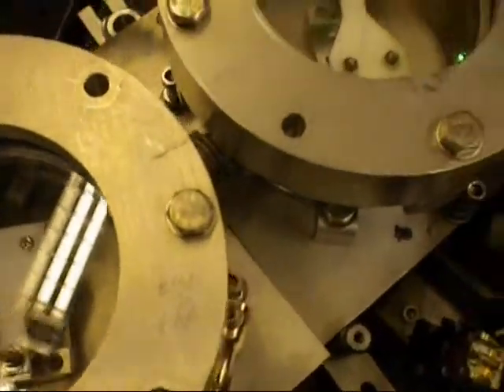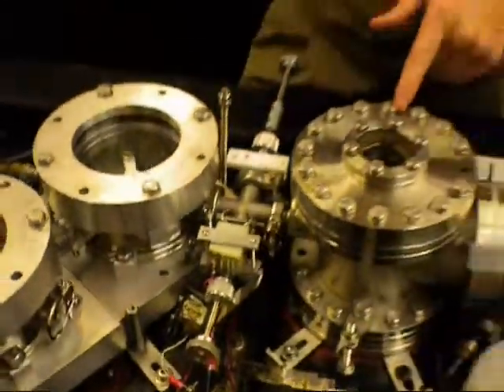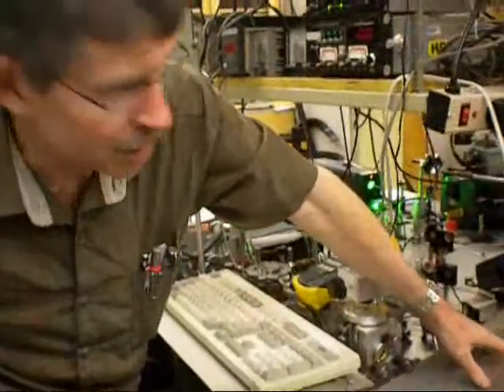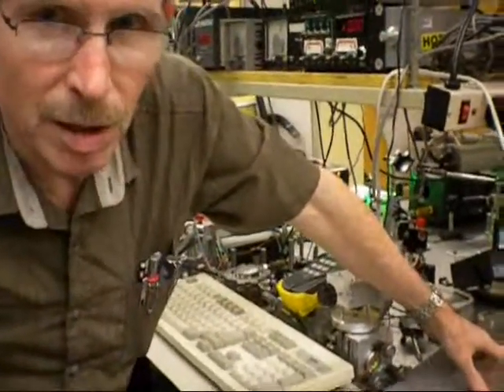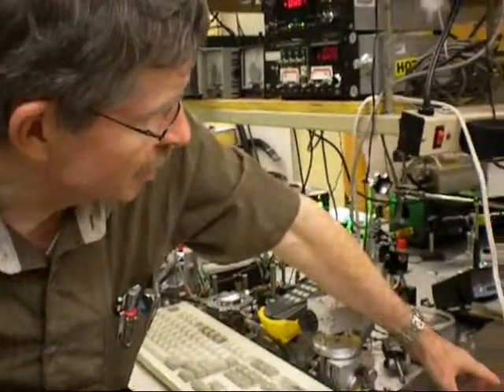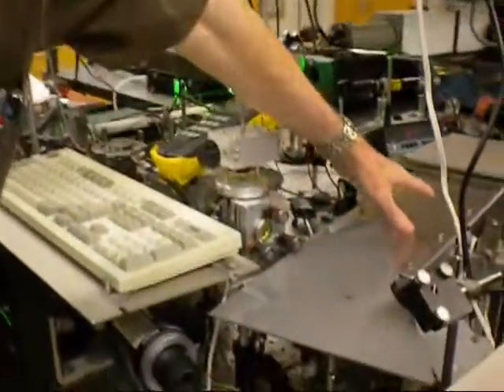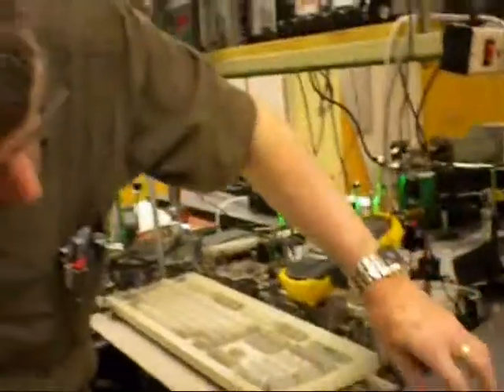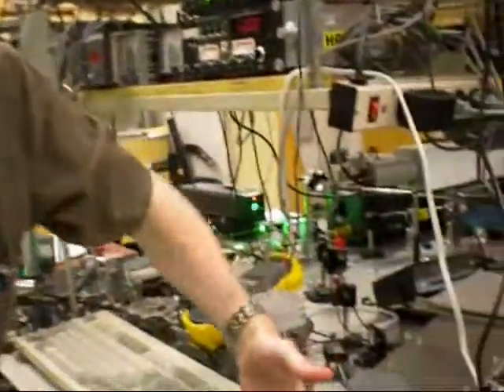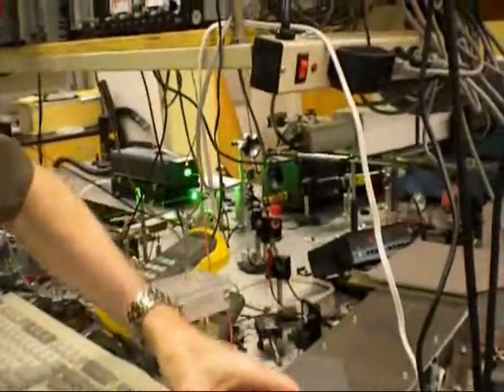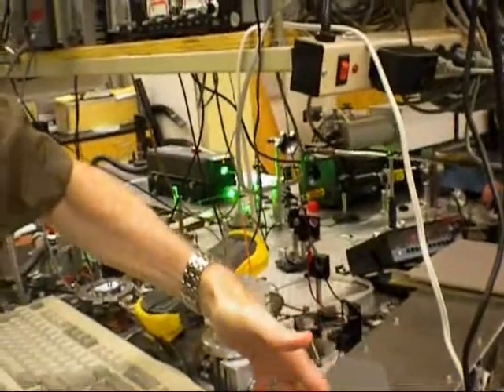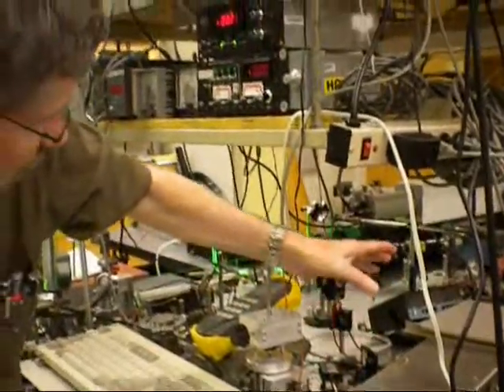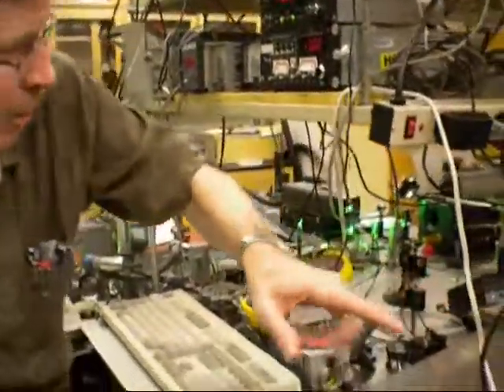It turns out, as you know, the pump beam is very close to the infrared beam. But initially, this compartment constitutes an oven, and the Ti:sapphire is contained within a quartz chamber with Brewster angle windows on it. We can't see them because we have it all blocked off, because generally speaking, if there's too much draft within the room, it sort of upsets the laser, and so it doesn't give a stable result as far as looking at the spectrum.